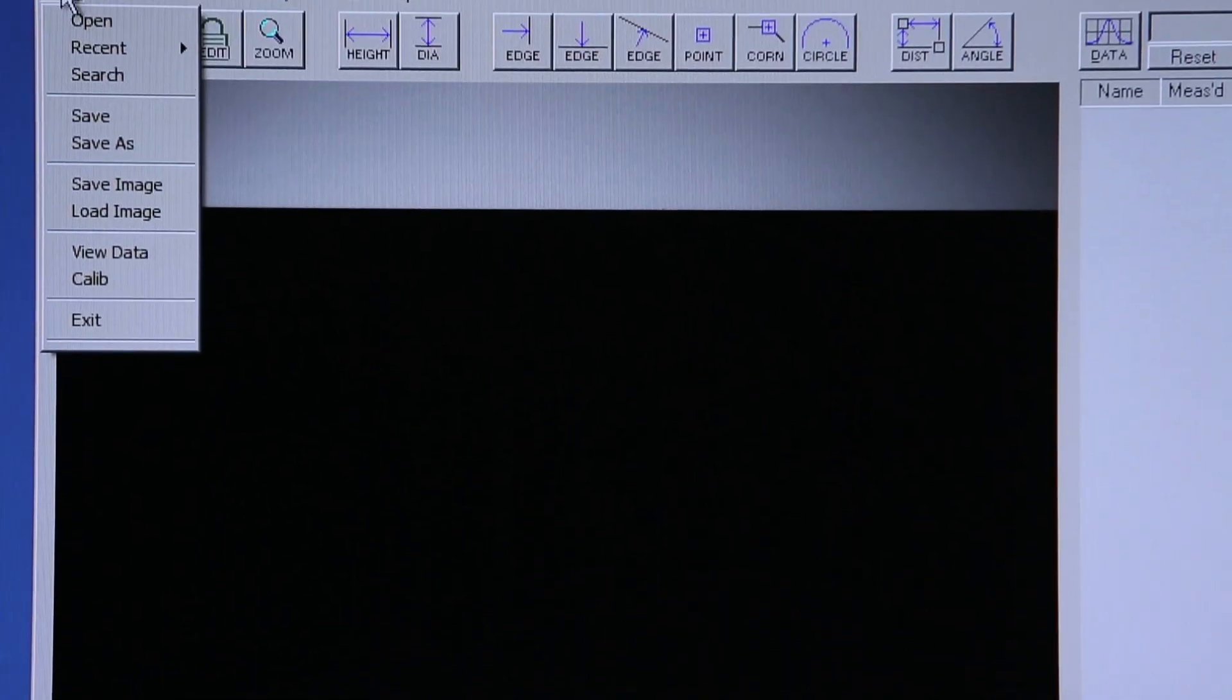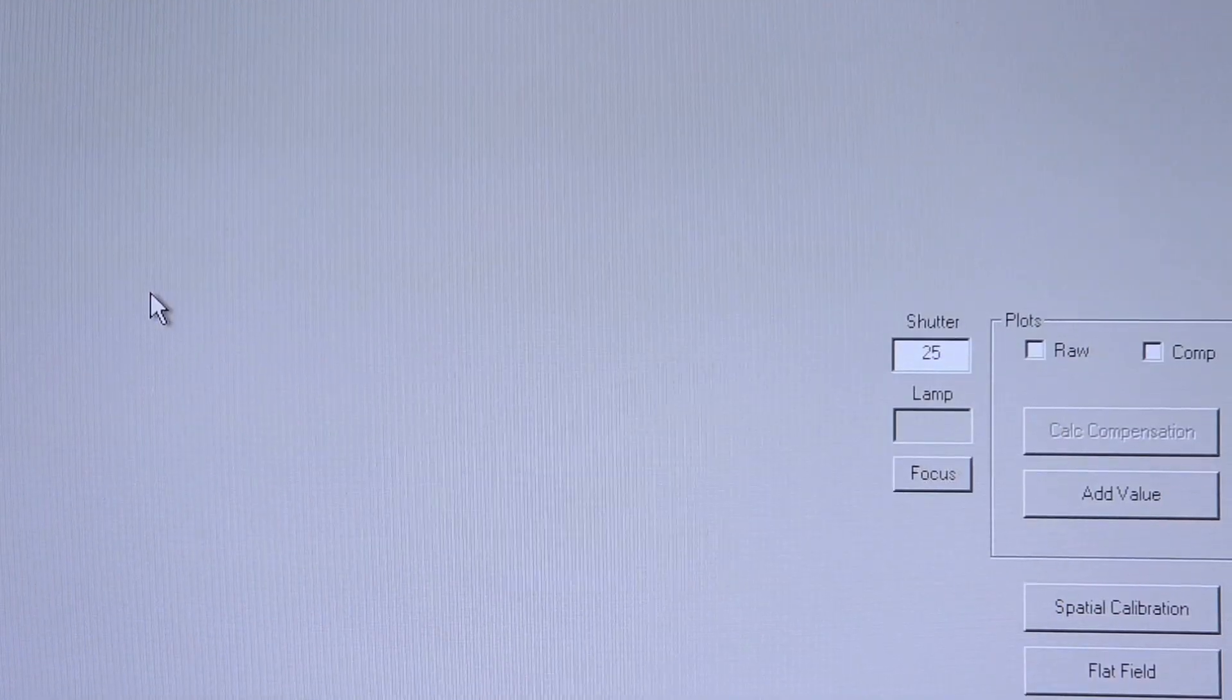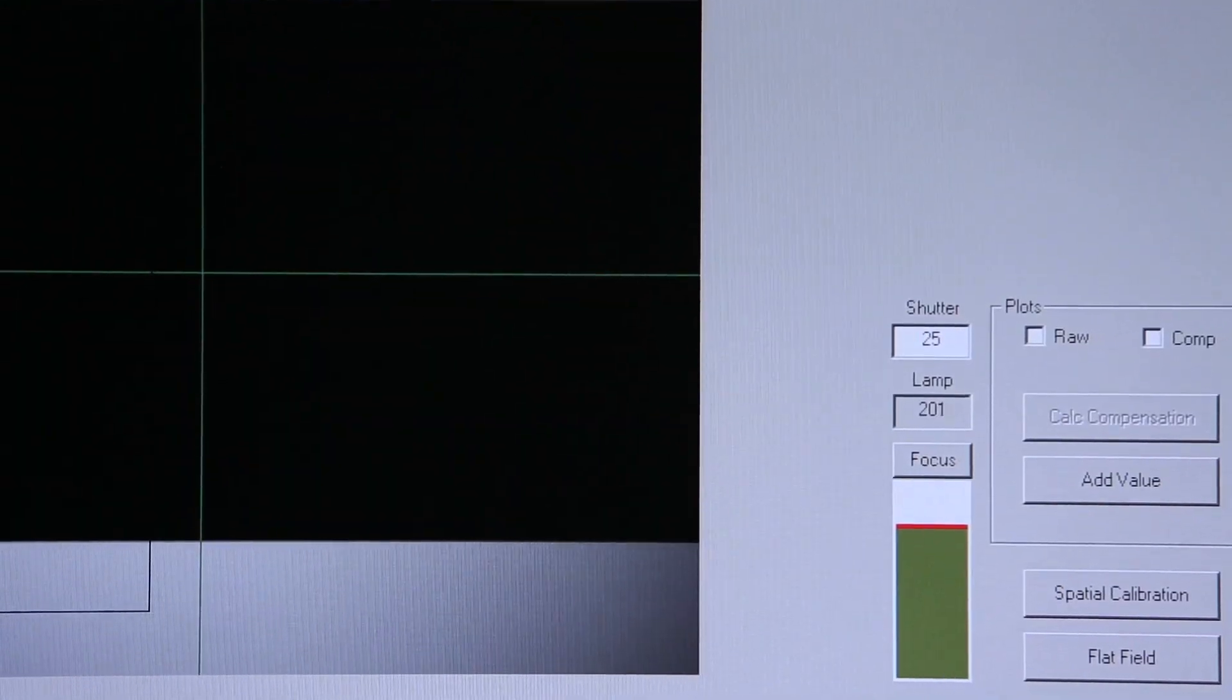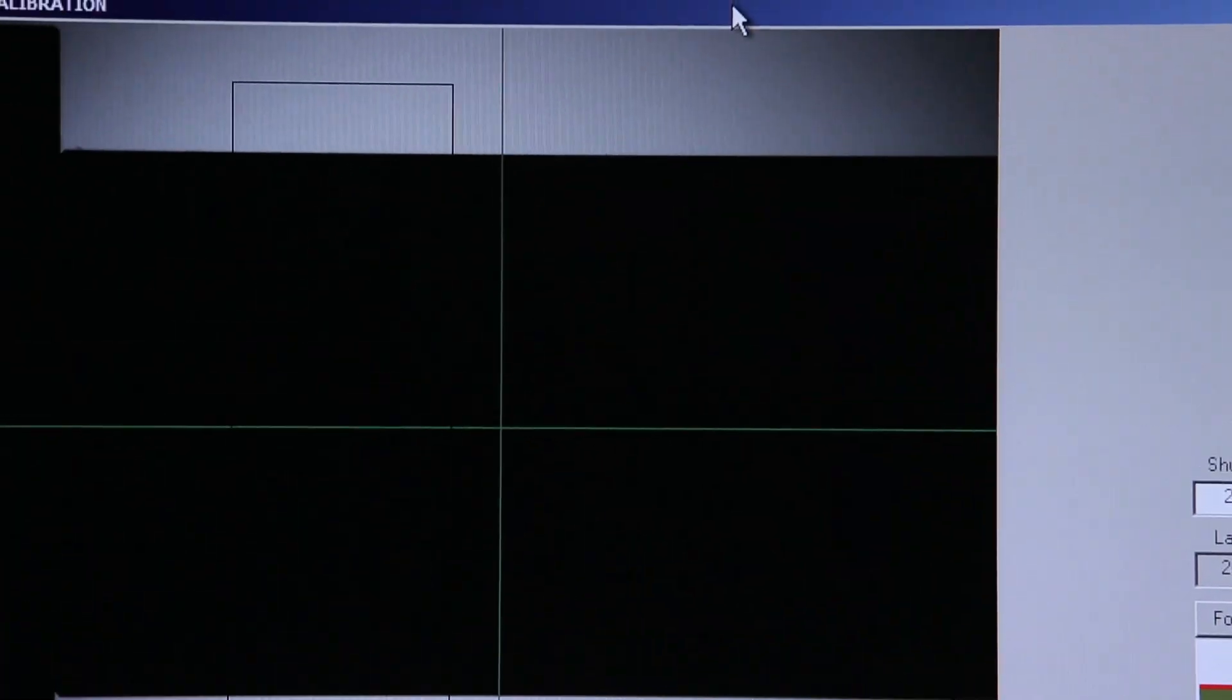Go to File and Calibrate. These pins are included with the purchase of your OASIS.